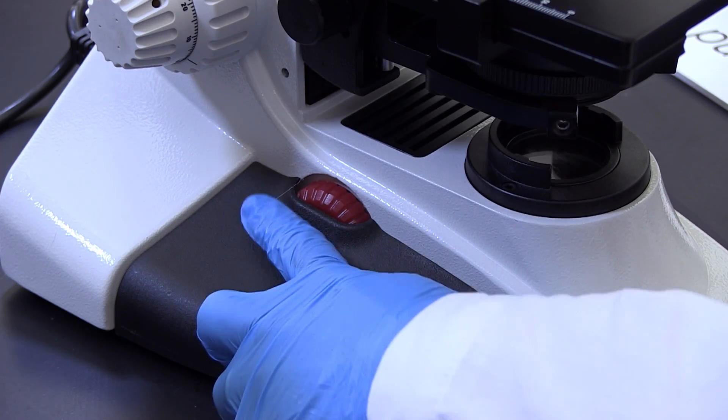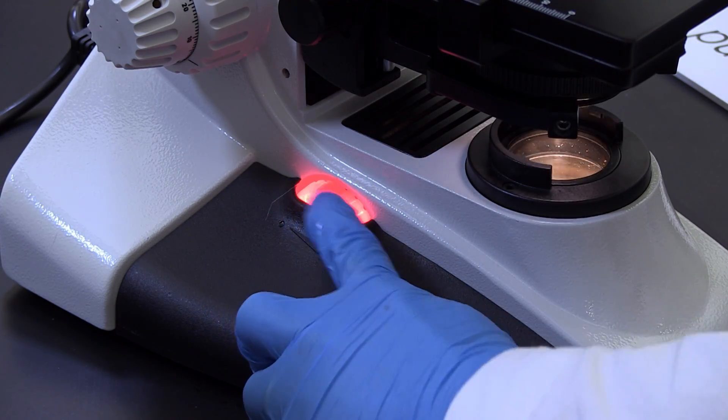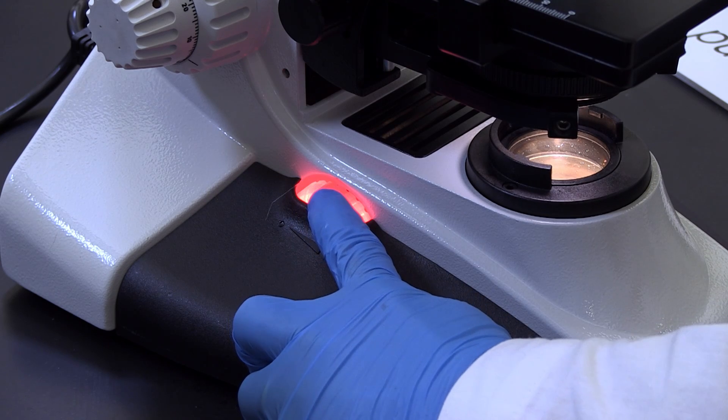A light source is located in the base of the microscope. A rotating wheel or knob can be used to adjust the intensity of the light.